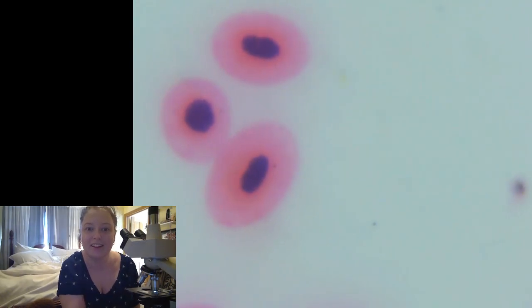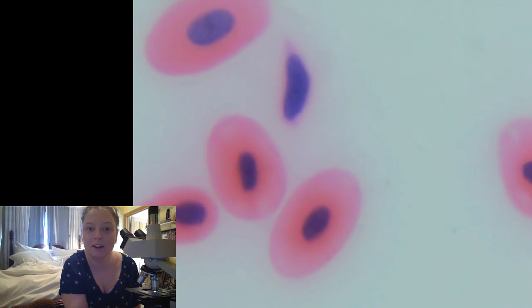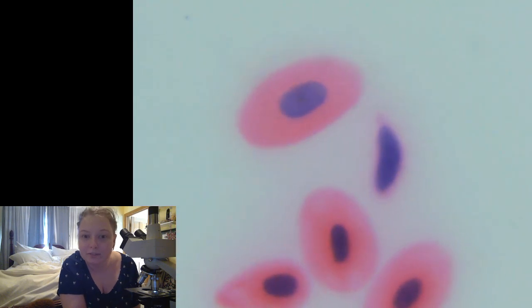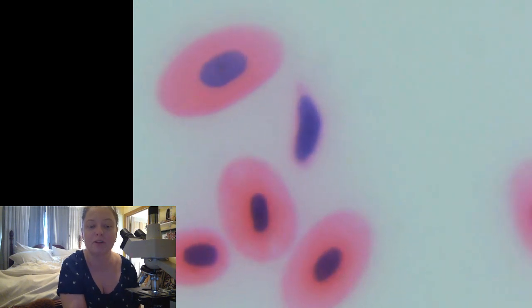Okay, so these are some blood cells from a frog. This is really interesting. I've never actually looked at frog blood before, so you are experiencing this with me. Ooh. Getting a little out of focus there.